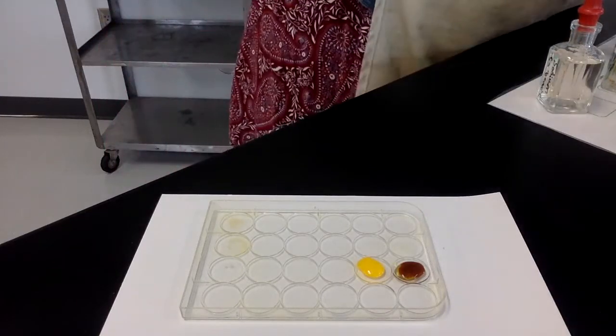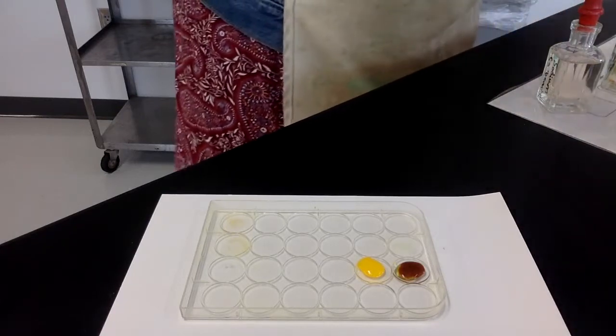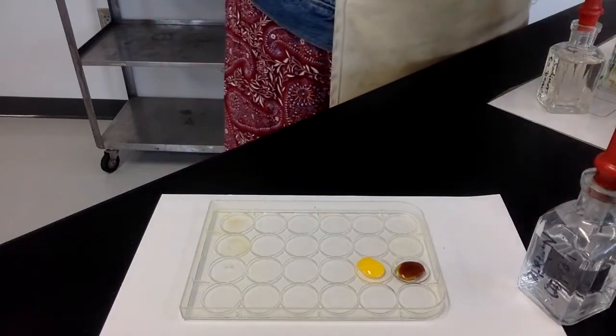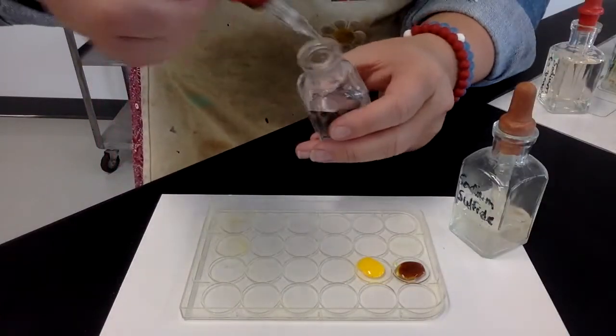All right, we're doing reaction number 3. I've got to move my pages here. Reaction number 3 is between lead 2 nitrate again, and then this time, sodium sulfide. All right, so let's get our couple drops of lead 2 nitrate.